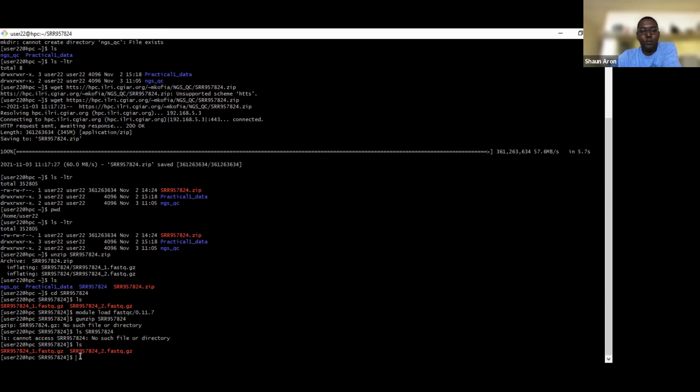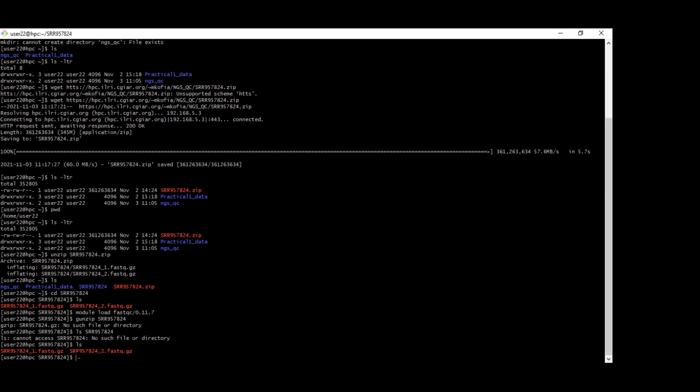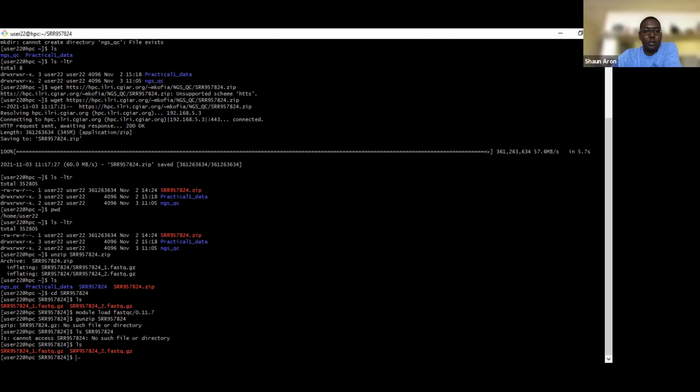Okay. Do you want to jump to that? I can help you jump to that step, and you can go back maybe when you have time and do the first part. No problem. You can just assist me from here. Okay, so fastqc, have you loaded the module? Yeah, I think we did.